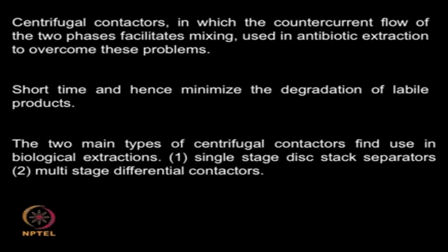So, the advantage is that it is going to be a shorter time because separation can be achieved because of the high forces you are using. It is practiced in extraction of antibiotics from the fermentation broth. There are 2 types of centrifuges you can resort to for biological systems. One is the single stage disc stack separator, the other one is the multi-stage differential contactor.